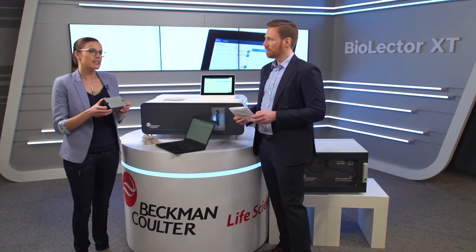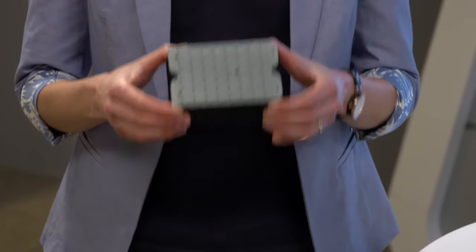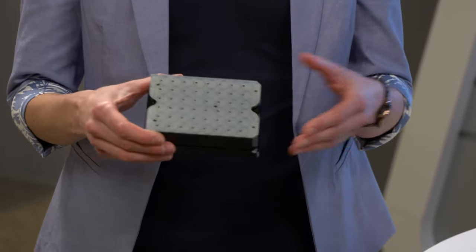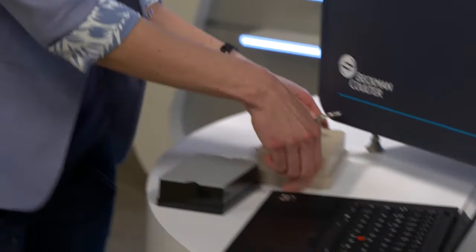I've been working with the BioLector XT for a couple of months now. I would like to highlight the general BioLector principle, with which I previously saved a lot of time preparing experiments. When you prepare a microtiter flower plate, you can set up various cultivations in microscale at the same time. Next, you cover the plate with the appropriate foil and place the gassing lid on top.